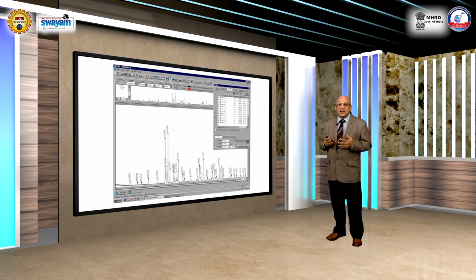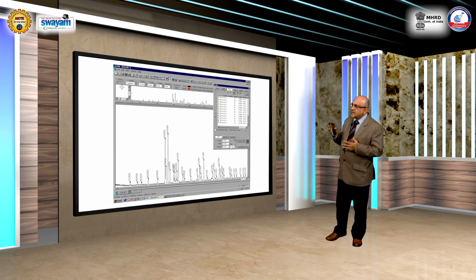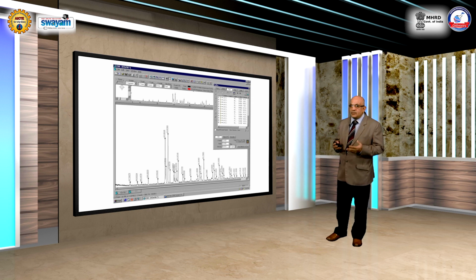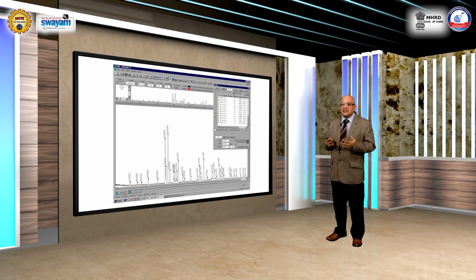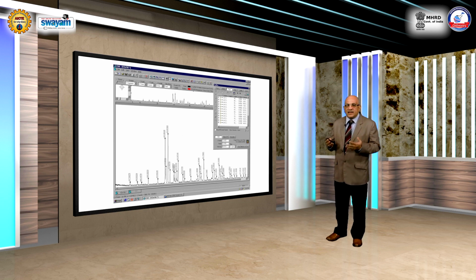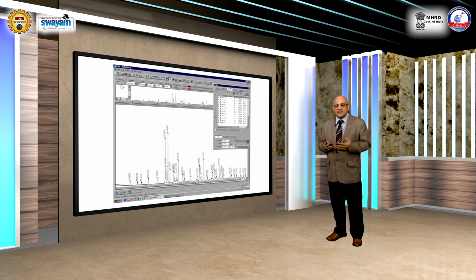various files as shown on the right hand corner. That is a file which you have pulled out from the software where a lot of data is stored, and you can match your X-ray with the reflections of a particular sample which is stored in the file you are accessing through your software.